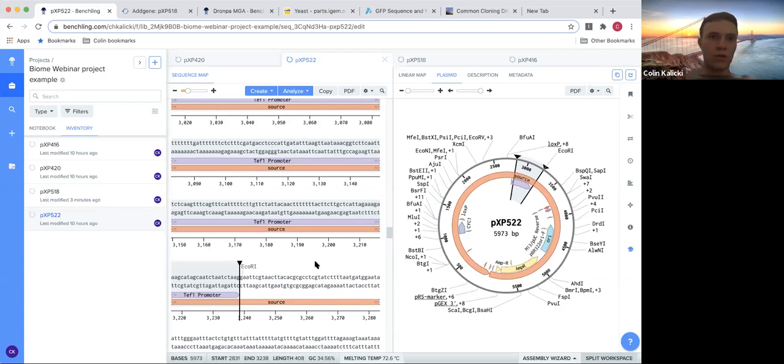And so what you're going to want to do is have your mRNA, right? The next step in this dogma of things, carry some sort of sequence to say, hey, right here, this is where I want you to start translation. Because it doesn't just translate and transcribe all at once. It needs a starter kind of codon or a starter sequence in order to do it. And so what do we call those? And oh, would you look at this? I don't actually have it pulled up, but I'll show you what it is.